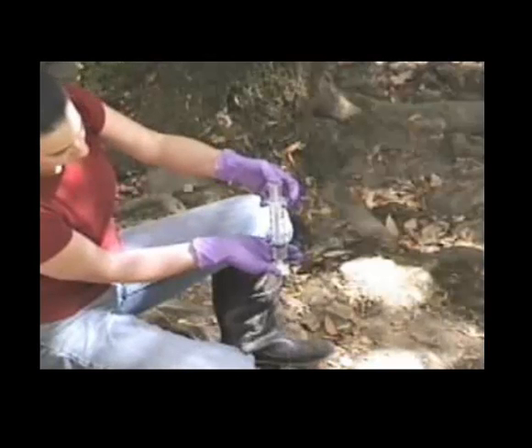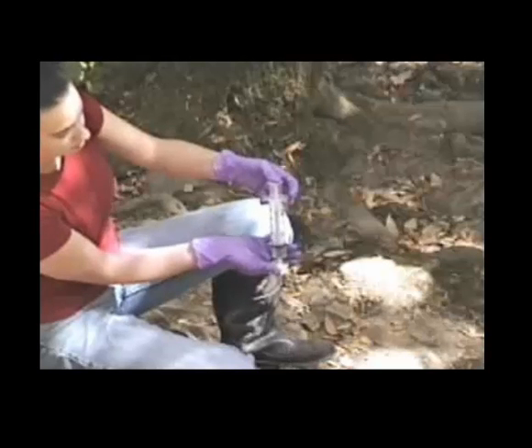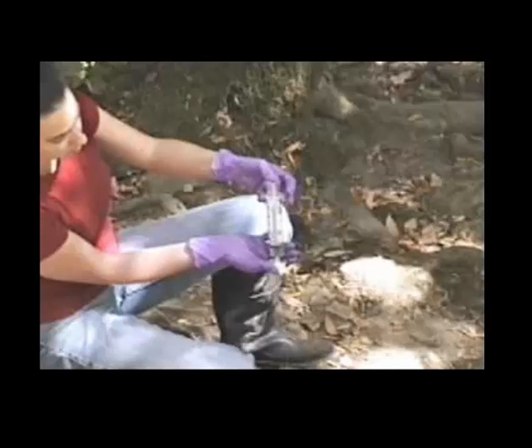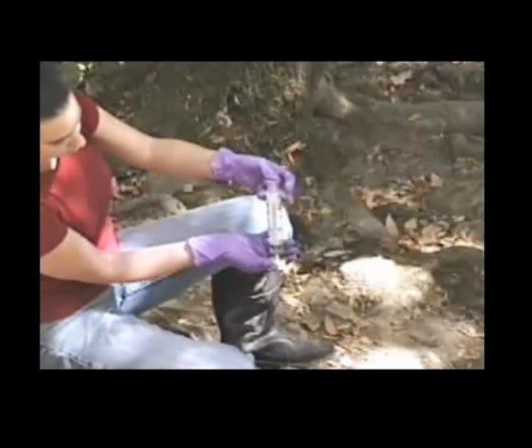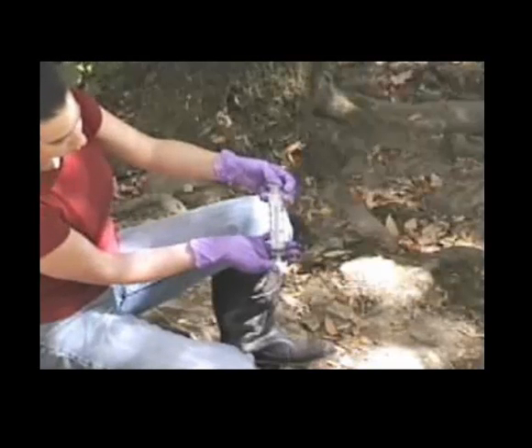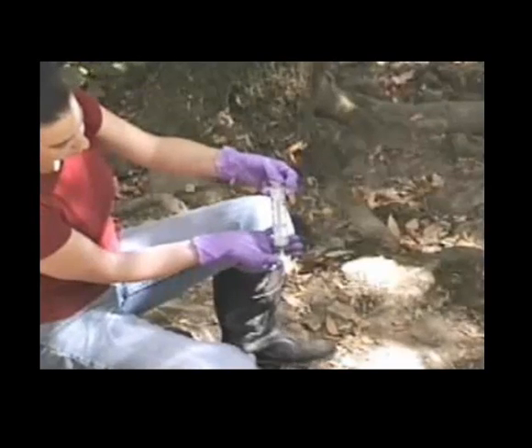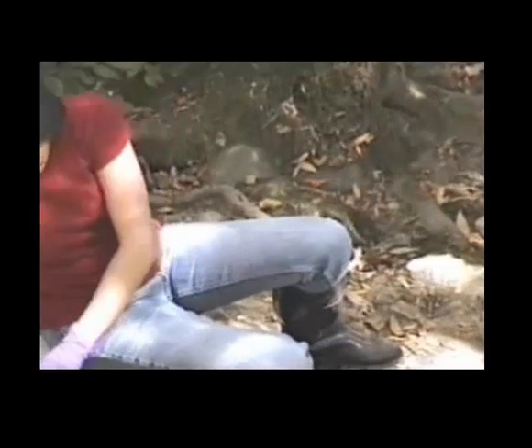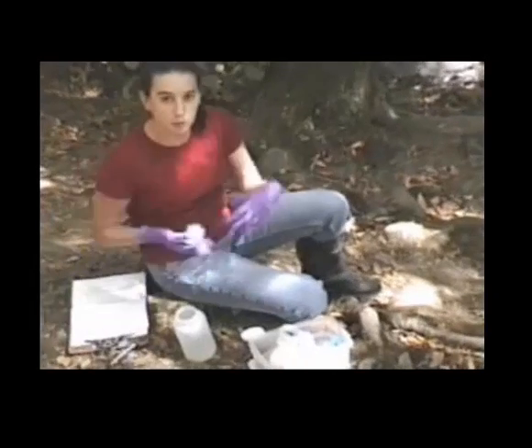And the volume of water that you're going to put through the filter is going to depend on how much suspended particles are in the water. The more suspended particles, the less water you're going to use. So it's a judgment call. And you want to keep track of how much volume you're putting through the filter.